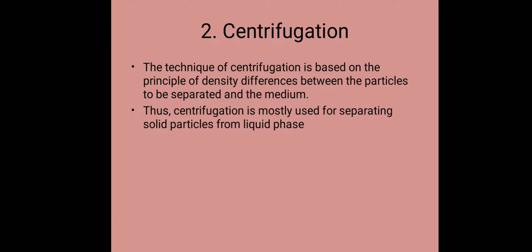Now, the next step is centrifugation. After filtration, another method that we can use for removal of insoluble materials is the centrifugation method. Here we are going to use centrifugal force. The technique of centrifugation is based on the principle of density differences between the particles to be separated and the media.